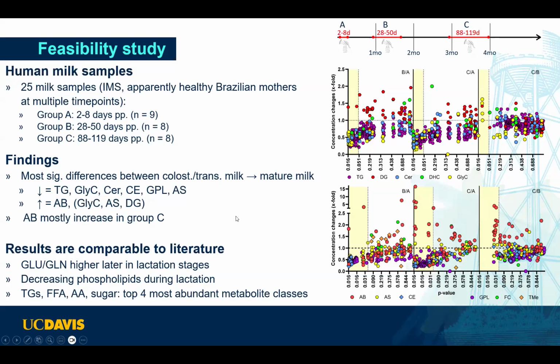And then we also looked into the literature to see if we find any longitudinal data just to compare our data to see if we are in agreement with the other data. And you should know and remember that we use the MxP plate, and the other person who used it is Terry. So it's the only direct comparison with the same method. Everything else is probably LCMS based. Some would be GCMS, I think, and of course NMR based metabolomics were also published. So we're comparing in terms of methodology, some apples to pears.